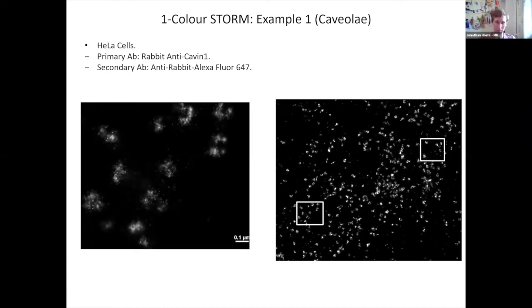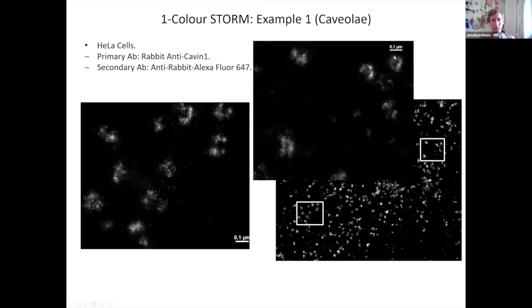And in some examples, we can see an actual vesicle that's already been released from the membrane, but it's still quite close to the membrane, so it's still visible in the TIRF field. So that's obviously really good resolution. That scale bar is 100 nanometers, so probably the resolution here is 50 or better.